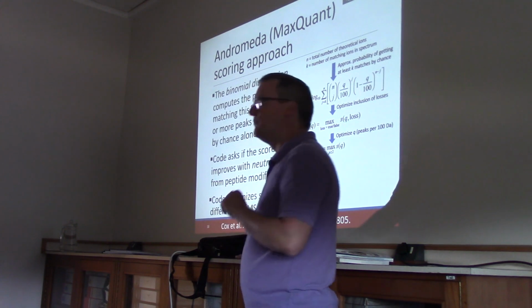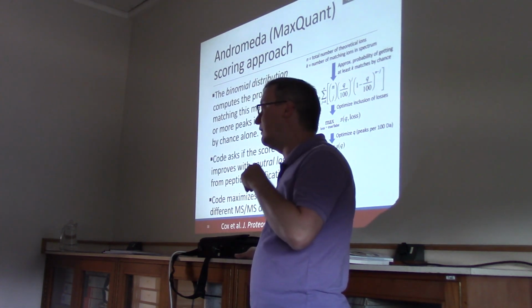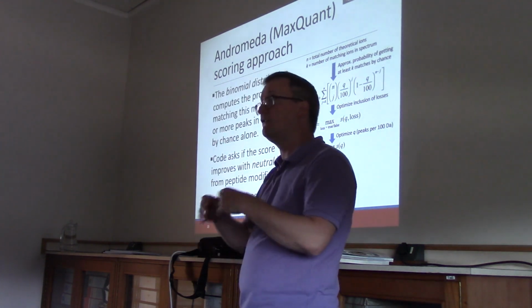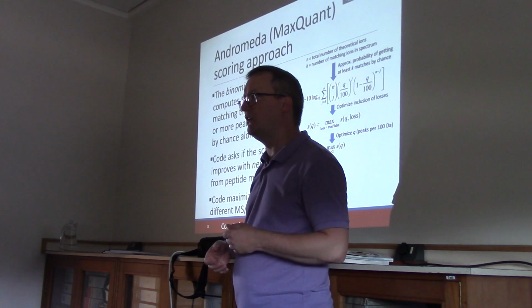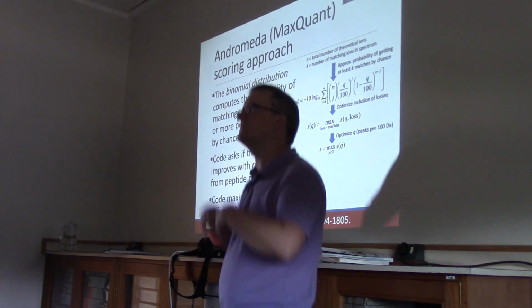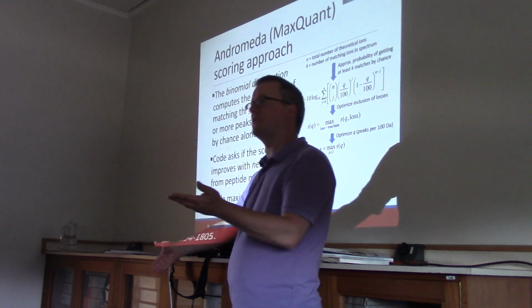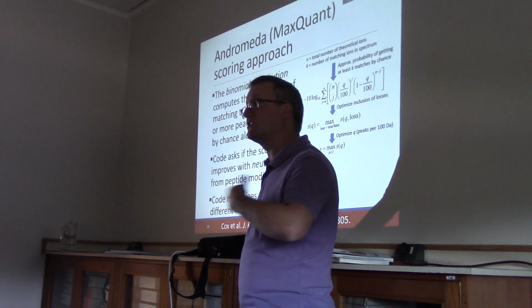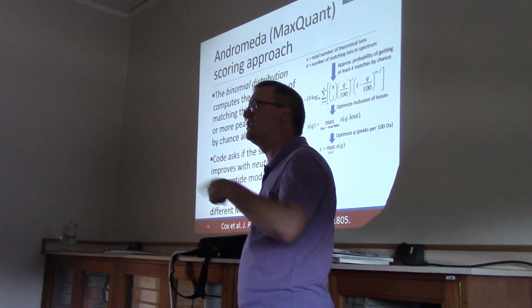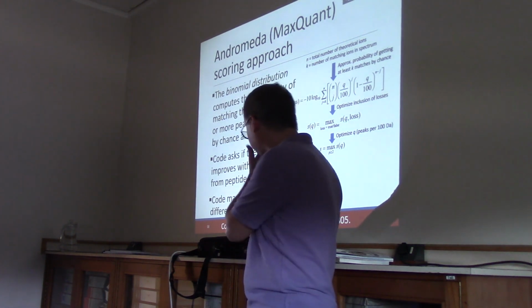One is that some peptides throw off water or throw off ammonia from their fragment ions. So the software asks, if I build those in, if I say this peptide has an oxidation on methionine, does it also lose a particular mass associated with that? Then, if that makes the score go higher, it's going to accept that those modifications, or that those losses, should be modeled in the spectrum.